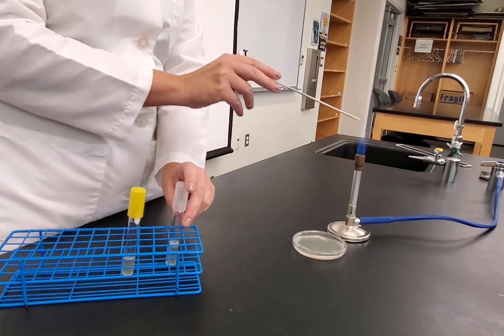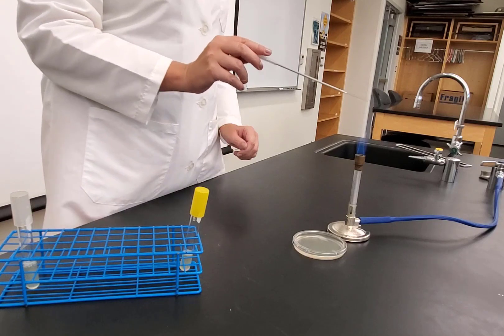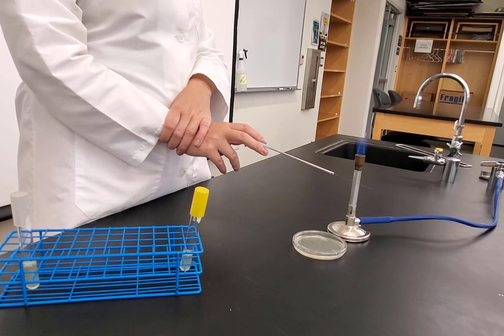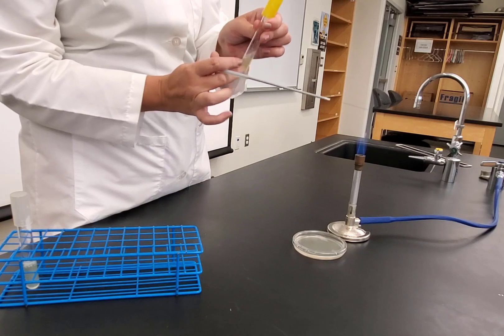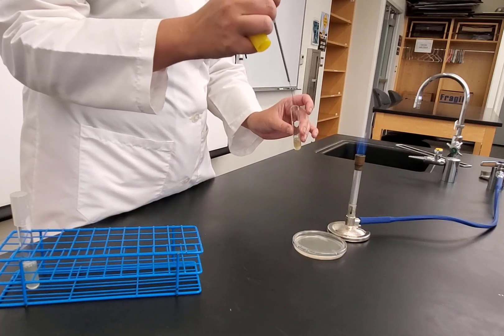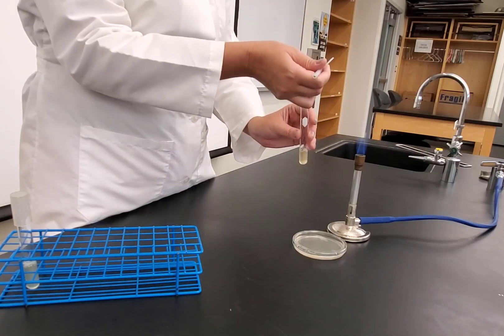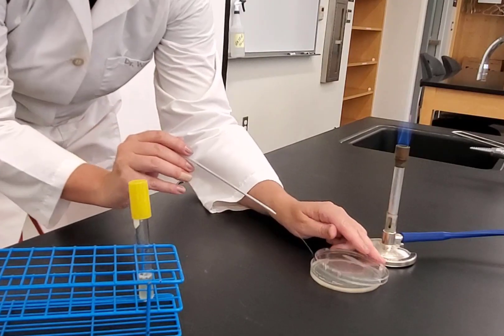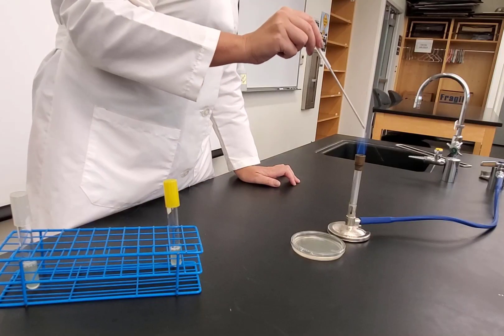Letting the loop cool while getting ready to do Staph aureus. Keep the loop close to the flame, then vortex. Cap between pinky and ring finger, flame it, go in, pick up some bacteria, flame it, put the cap on. Keep your loop hand as steady as possible, then one broad streak going down, and flame it.